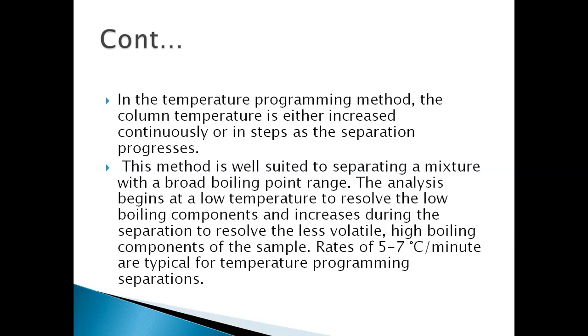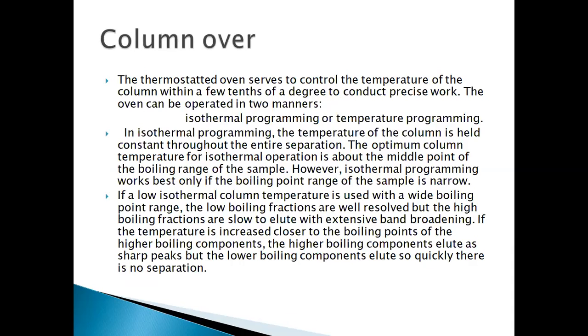Isothermal and temperature programmable operations. In isothermal operations, the column temperature is constantly maintained, with decreased sample throughput. Run times are longer than temperature ramping. Broad peaks for late eluting components.